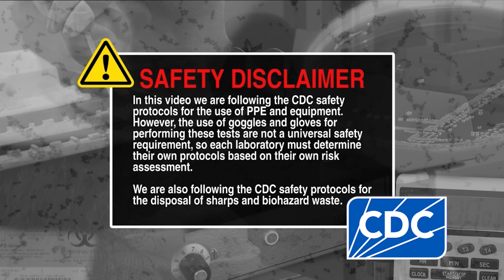In this video, we're following the CDC safety protocols for the use of PPE and equipment. However, the use of goggles and gloves for performing these tests are not a universal safety requirement, so each laboratory must determine its own protocols based on its risk assessment. In this video, we're also following the CDC safety protocols for the disposal of sharps and biohazard waste.